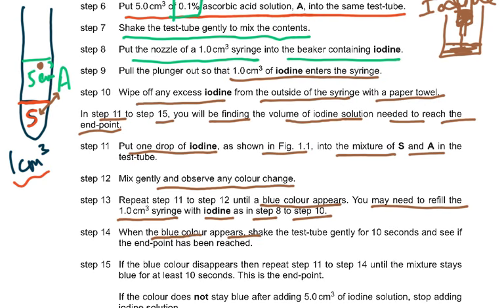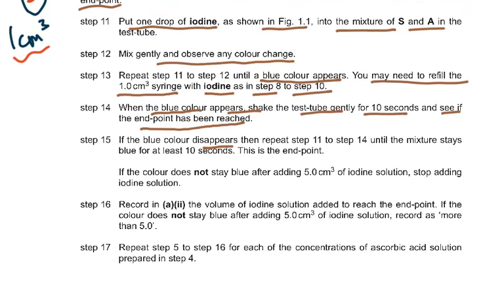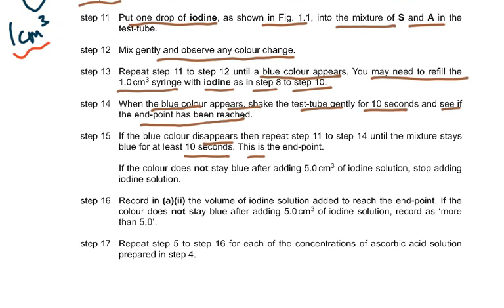When the blue color appears, shake the test tube gently for 10 seconds and see if the endpoint has been reached. If the blue color disappears, then repeat step 11 to step 14 until the mixture stays blue for at least 10 seconds. This is the endpoint.